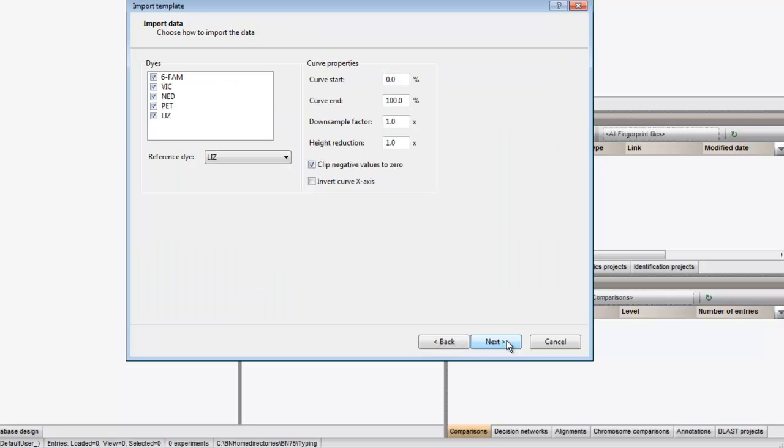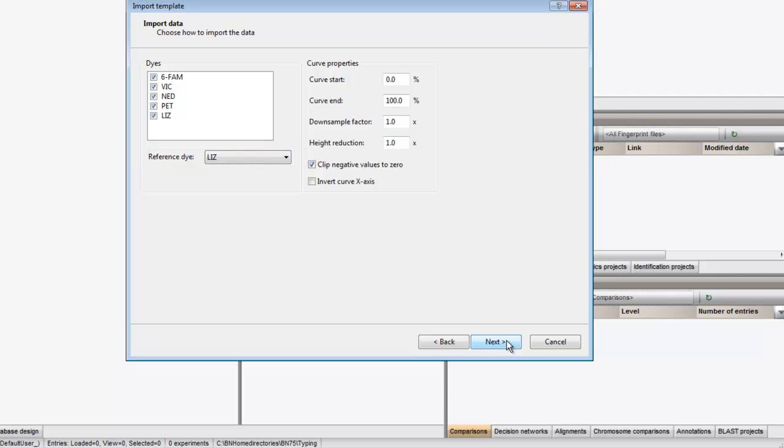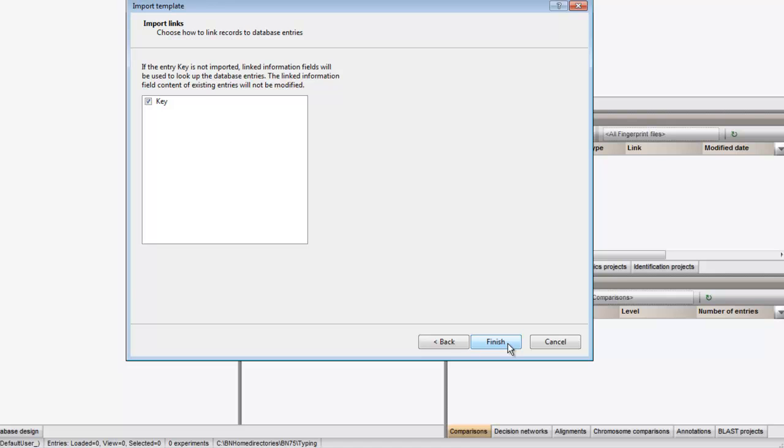In the next step, you can select the dies you want to import and indicate which die is used for the internal reference. Next, we choose to link the data to the entries by means of the key field, and we click Finish.